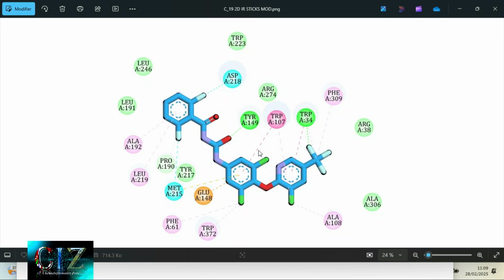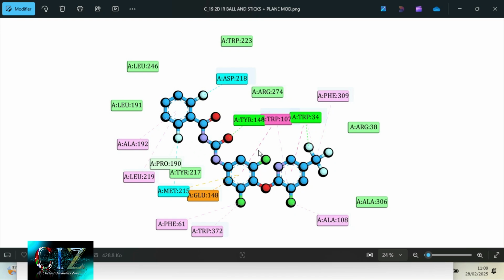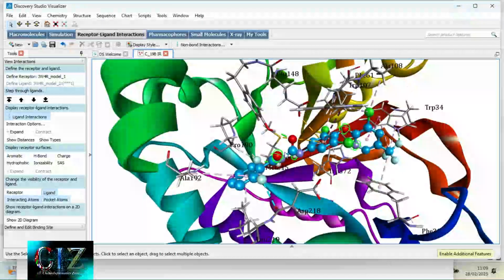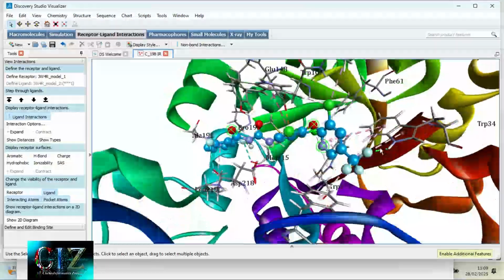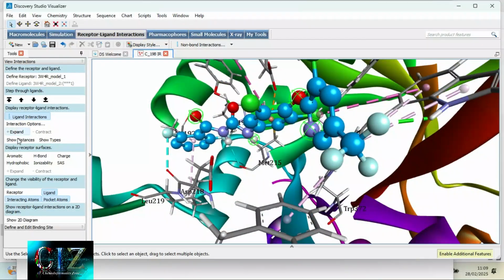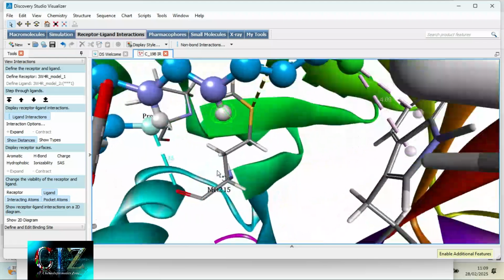There we have other kinds of images. There is here a sphere, and here a plate presentation for residues. Then how can we add distances? If you want to see the distances related to complexes or to elements, you can then click here on show distances, and you can now have the different distances.